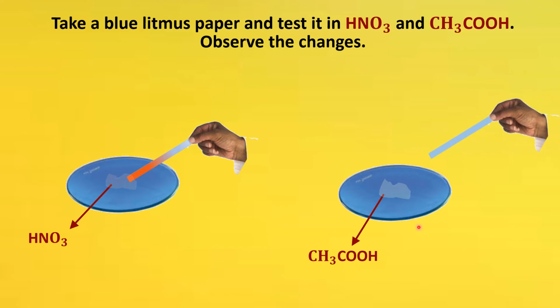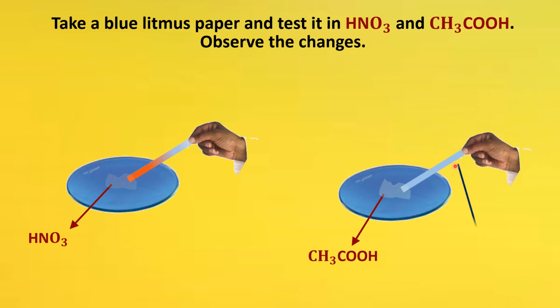This is a blue litmus paper. Yes, even acetic acid solution is also changing it to the red color.